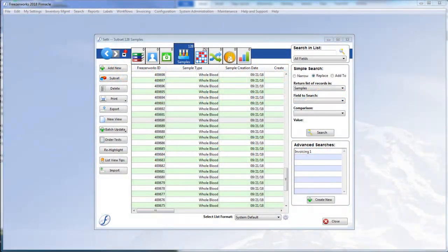Hello, welcome to your sample management solution Freezerworks 2018. Today we're going to take a short look at an easy to use yet powerful search tool called Search by Barcode.